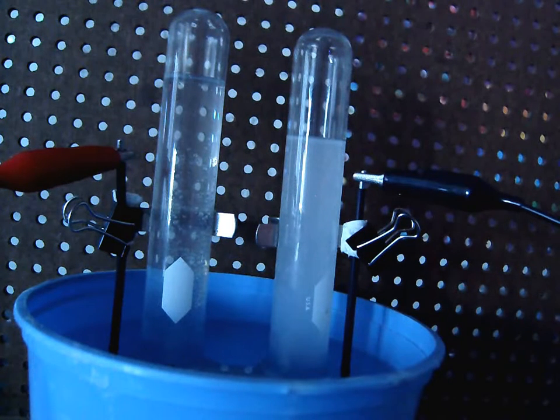One of the other things that we would normally do in this lab, we did not do this in class either, but it's important to talk about just in terms of identifying the gases. What we could do is we could let this run a little bit longer, and then we could stopper the test tube and pull the test tube out, and then we could keep the test tube inverted and let the remaining water in the test tube out into the sink.